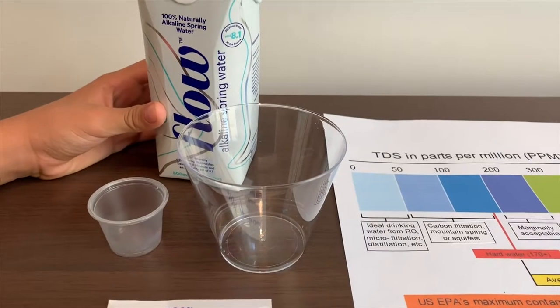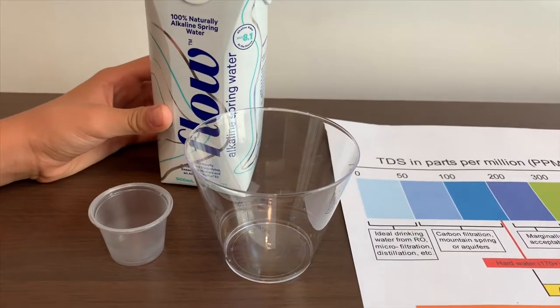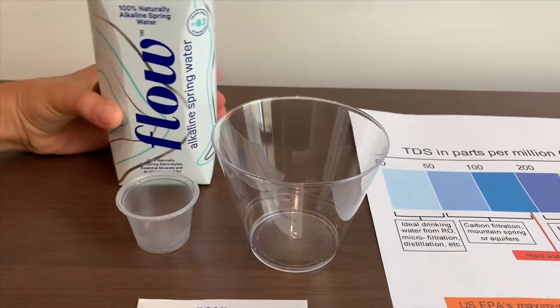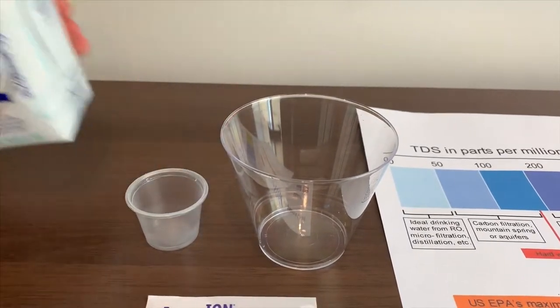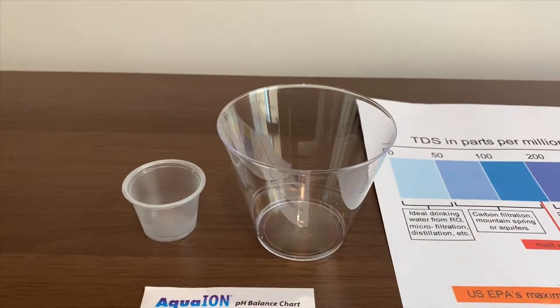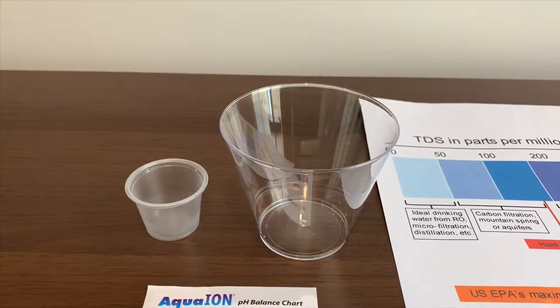This is Flow, and it's 100% alkaline spring water from Canada. It's supposed to have a pH higher than 8, and it costs $1.50.